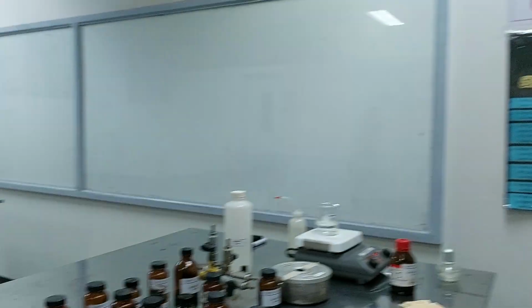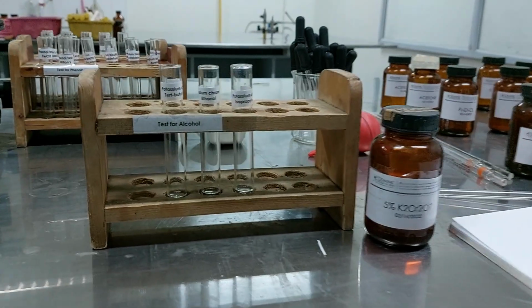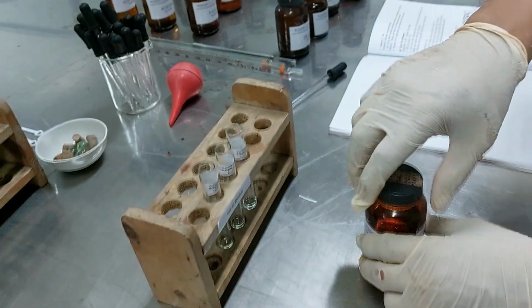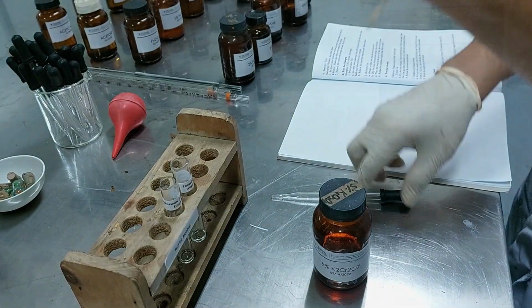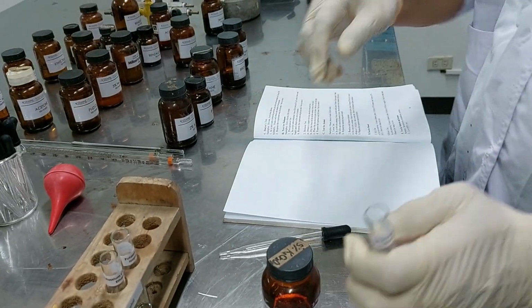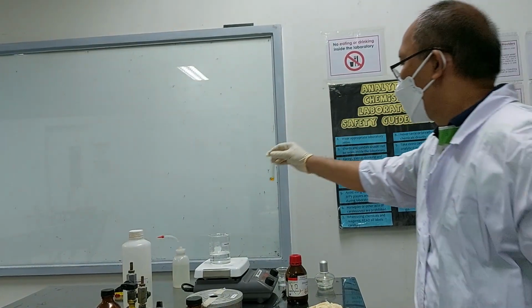Okay, so let's see. We have here ethanol, isopropyl alcohol, and tertiary butyl alcohol to represent primary, secondary, and tertiary. And we have our potassium dichromate, which is orange, under acidic condition. Let's start with tertiary butyl alcohol. We have 10 drops, and we're going to add 10 drops of potassium dichromate. Place this in a hot bath to see whether there will be a reaction.